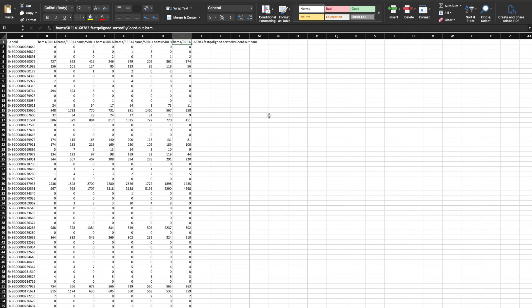So you could have done the same thing here in Excel, and then just save it as a CSV, or you could have done it a number of different ways, including just dropping columns and renaming columns in R. So next time, we'll open this up in R and use DESeq2 to do some simple differential expression analysis.